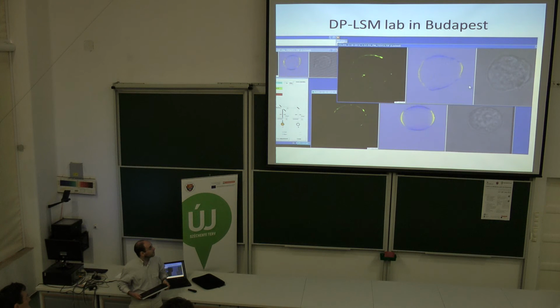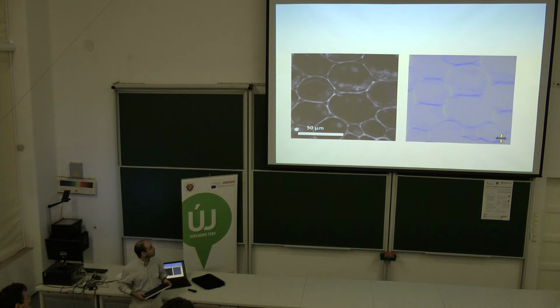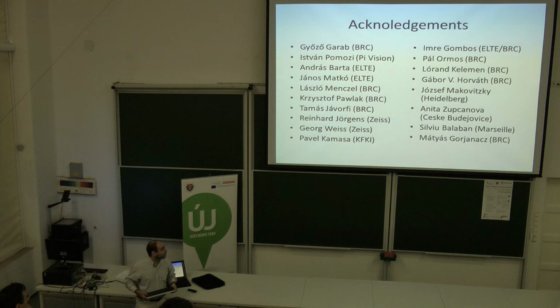and imaging cells with different treatments, different conditions. You can do quantitative measurements between some cross-linkers in the membrane, for example, to measure the effect of them. In recent times, several publications were launched on this topic, and we worked together with quite a lot of people.